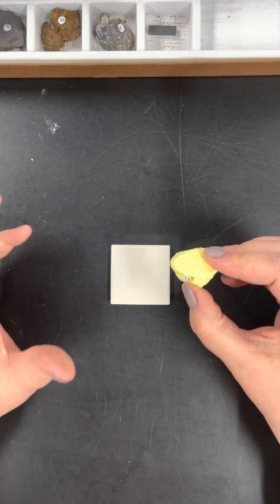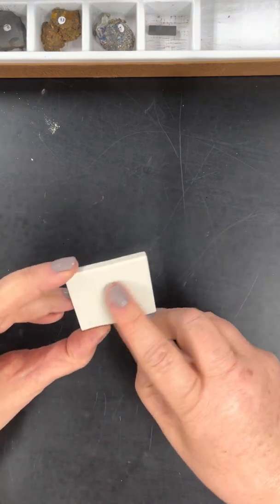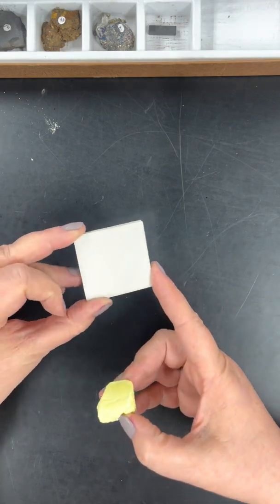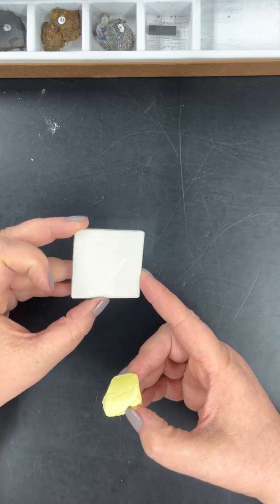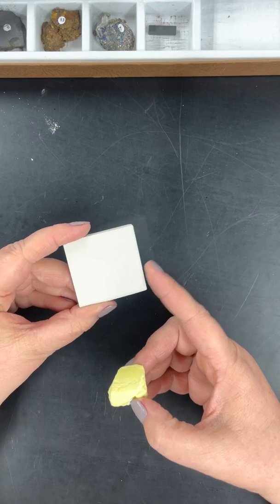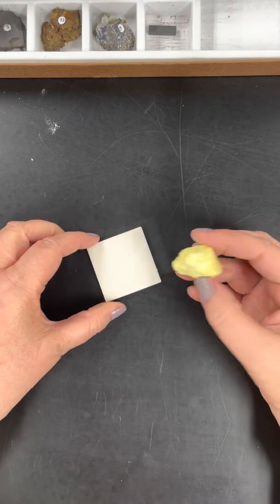And that helps to identify, because that's a very specific characteristic. So I'm taking an unglazed porcelain square. I know in your video it showed the guy was using sandpaper, and if I have time to go to the store today after school, I may grab some sandpaper for you guys and you can use that too. But here's what you do for a streak plate.